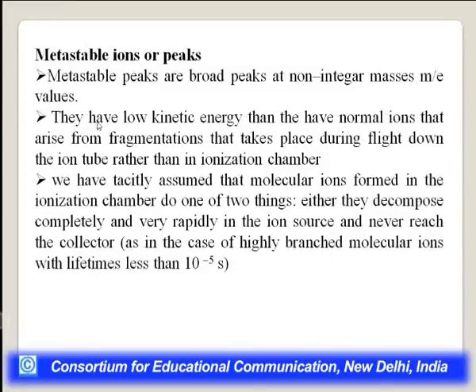They have low kinetic energy, which must be noticed also. So they will not reach the collector because they do not have appropriate kinetic energy to reach it. They have low kinetic energy, so they stay in between in the instrument and will not reach the collector.